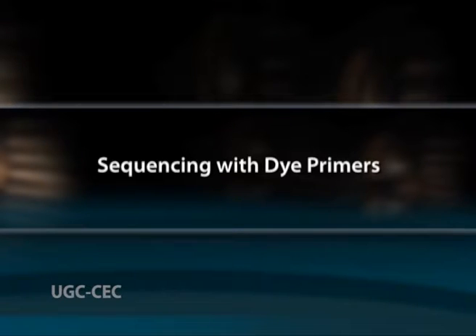Sequencing with dye-primers. 4 separate reactions are performed when using dye-primer based sequencing chemistries. Each reaction is labeled at its 5' end with any one of the 4 different fluorescent dyes. Each of the 4 sequencing reactions will contain a fluorescently labeled primer, either blue, green, yellow or red. The color of each reaction corresponds to either A, C, G or T.